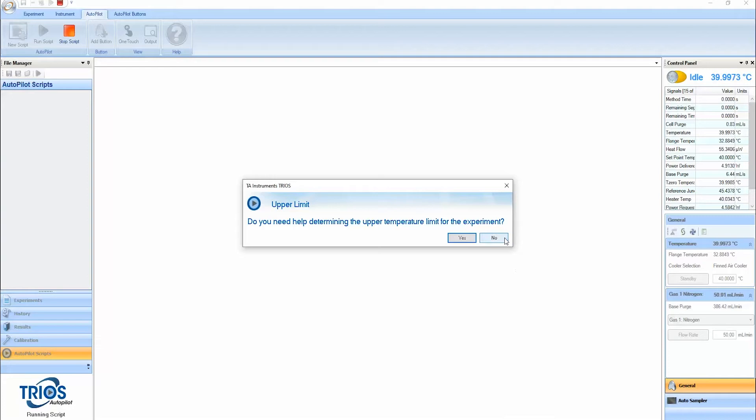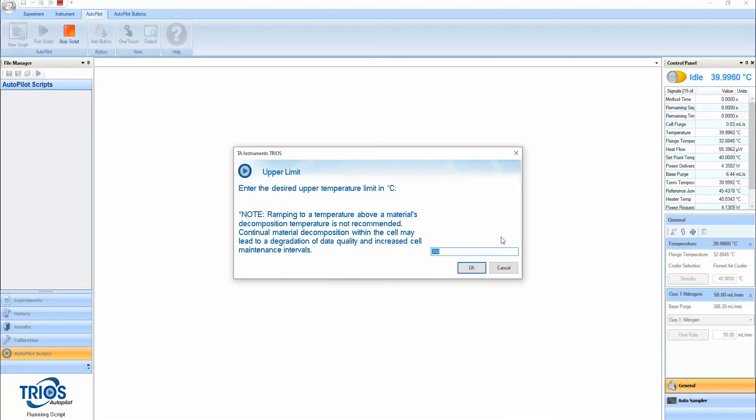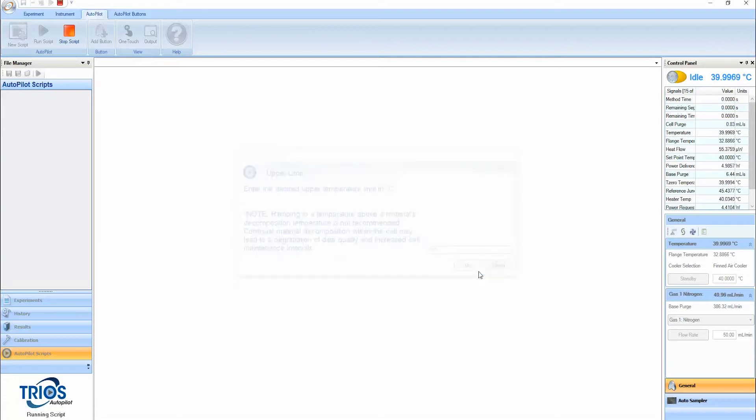The Glass Transition Guided Method leverages visual aids and specific prompts to help reduce mistakes and ensure that samples are loaded correctly.